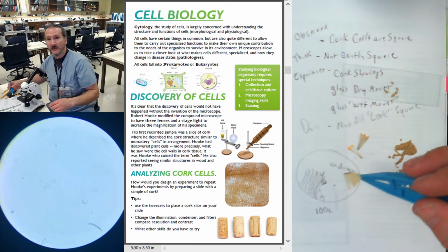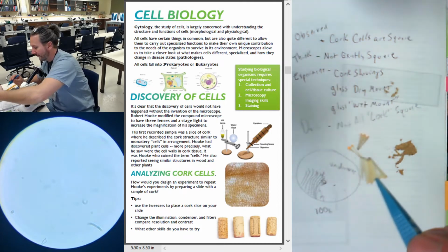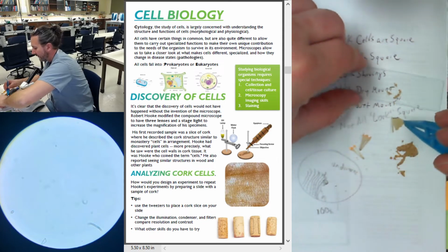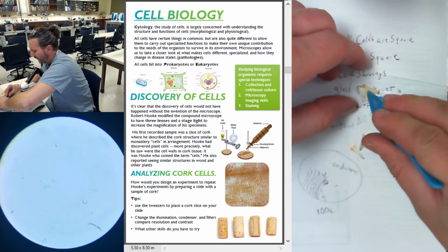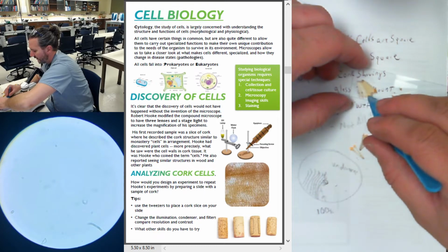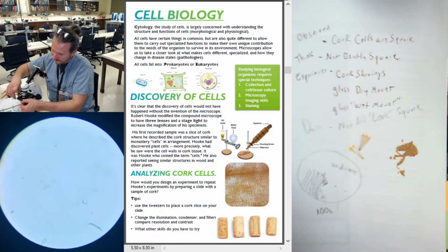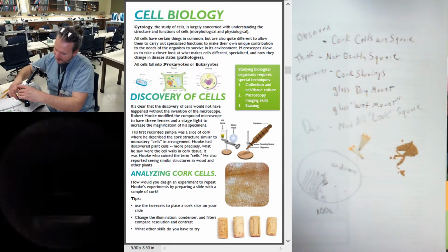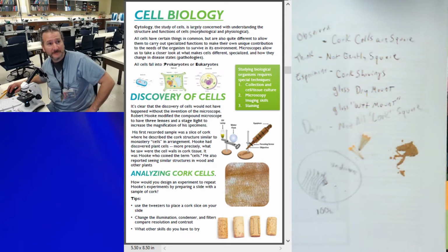Okay. So, you see the thin shavings? Super thin. You can see right through them. So I would repeat the same thing, except this time I'm going to say, I can see a pencil shaving. I can see the pencil's tree cells. I'm going to try it dry. Get my scanning up there. Open it up. Okay. Get my scope on.